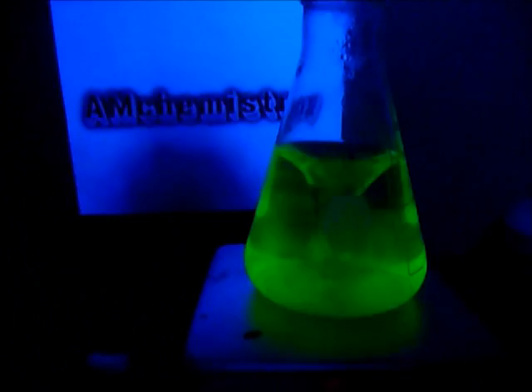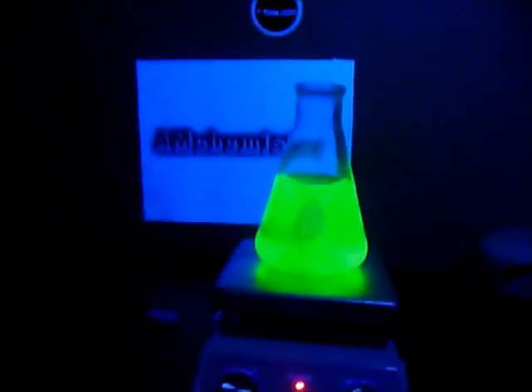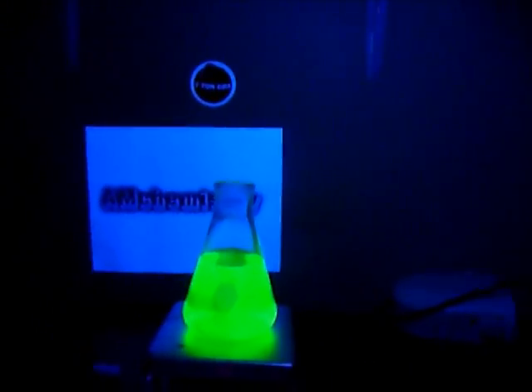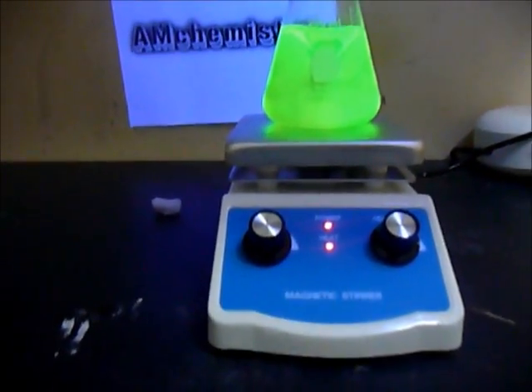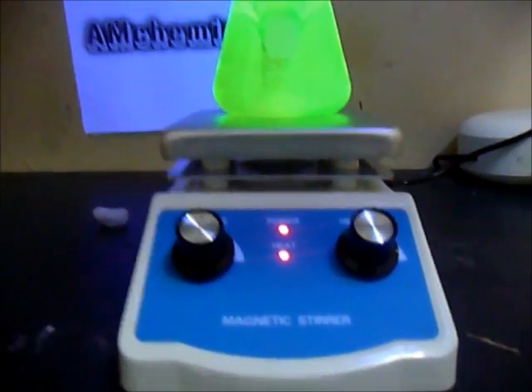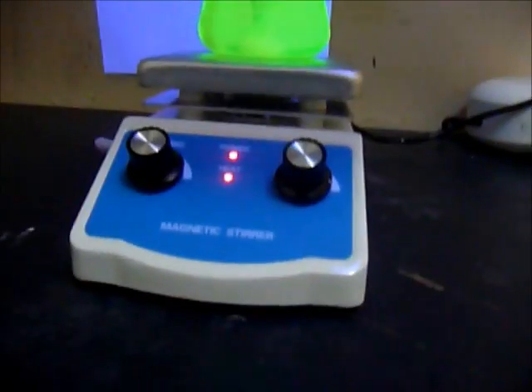I'll add some fluorescent dye and you can see it mix fast — it makes it really quick. So that indicates that it's mixing. That's my cheap magnetic stirrer.